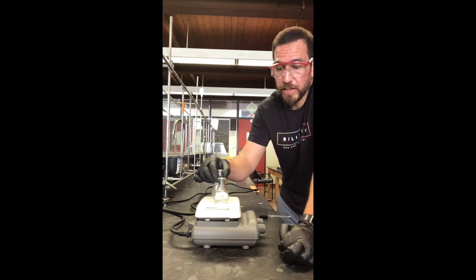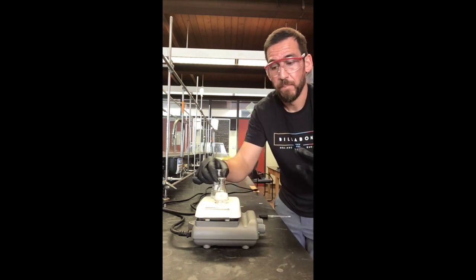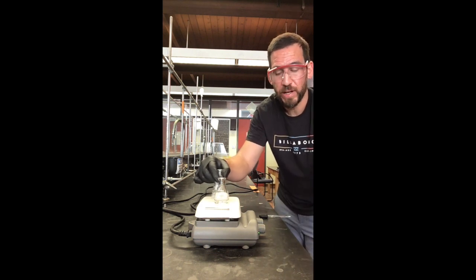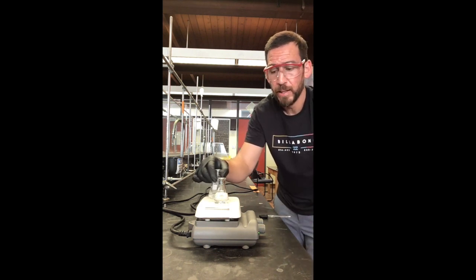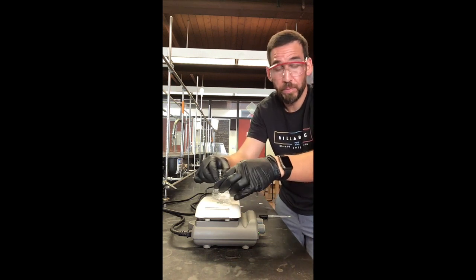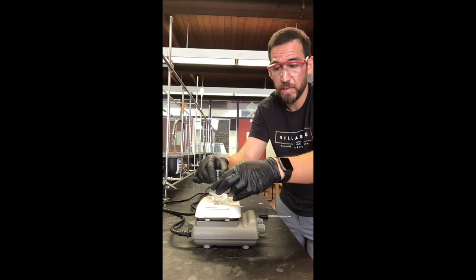But the key here is once it's all dissolved, set it aside and leave it alone. The slower and the undisturbed crystallization processes are always going to be the best, and they're going to allow for the best purification of your substance through this method, okay?